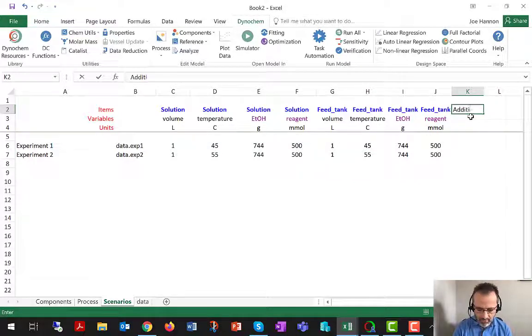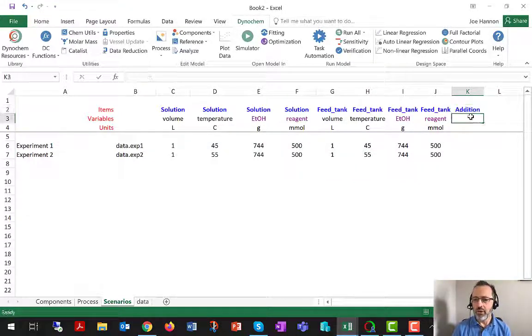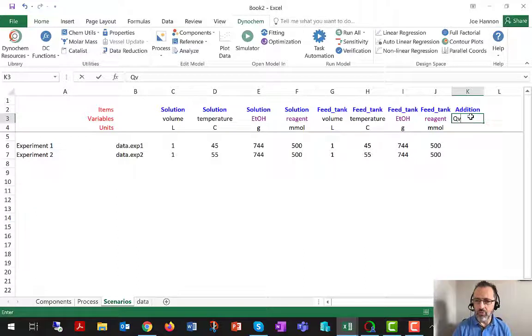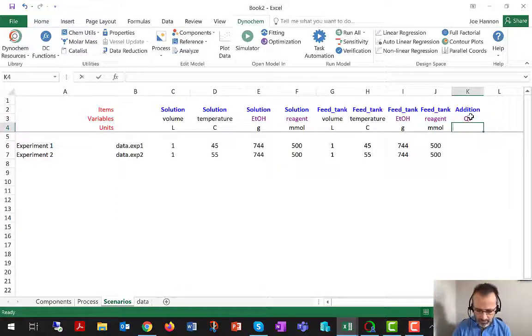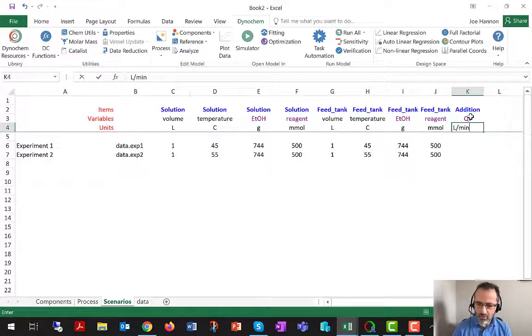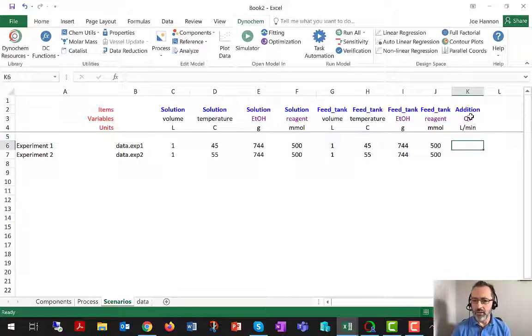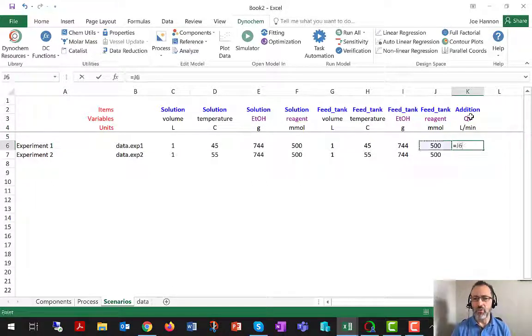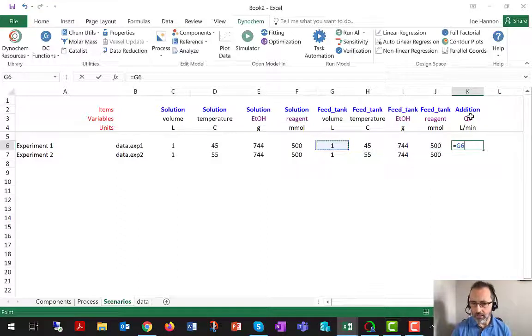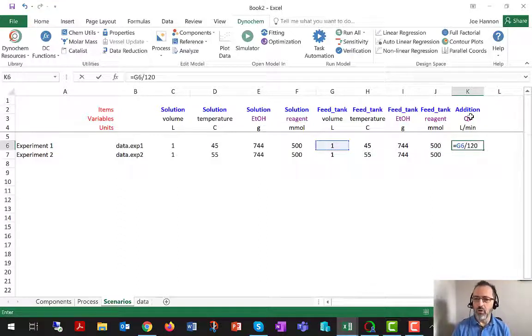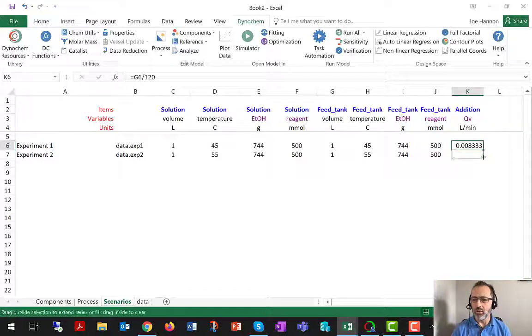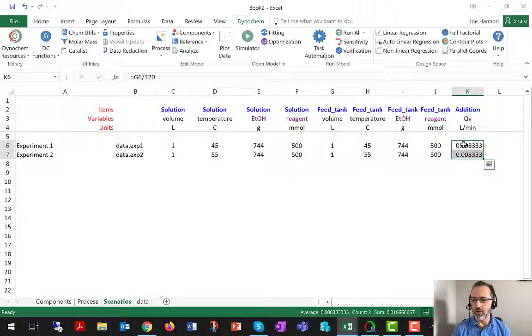A value of one liter per minute is currently defined on process. I'm going to override that on scenarios. So I'm just going to write in the top row the word addition. In the next row, the variable name QV. In the next row, the unit liters per minute. And then I'm going to use an Excel formula to link to the liters in the feed tank and divide by 120 to say that we would like this addition to happen over two hours.